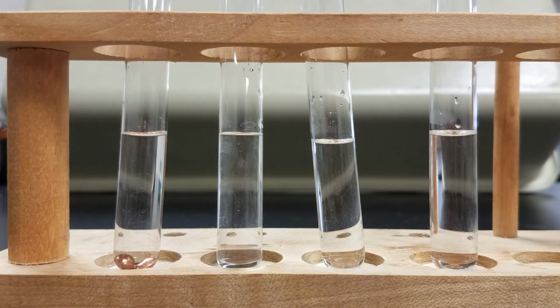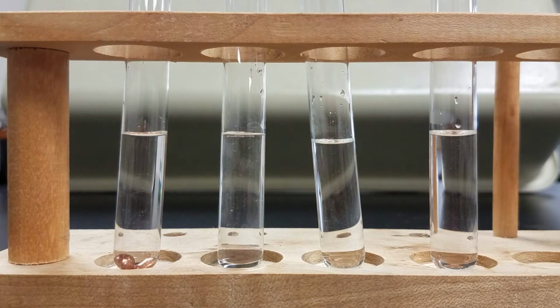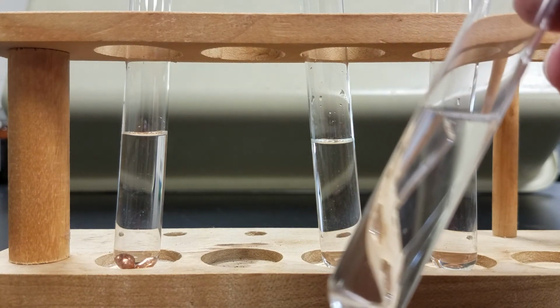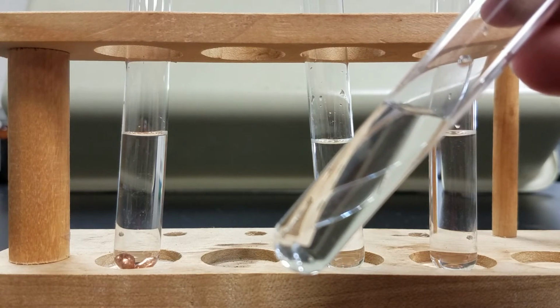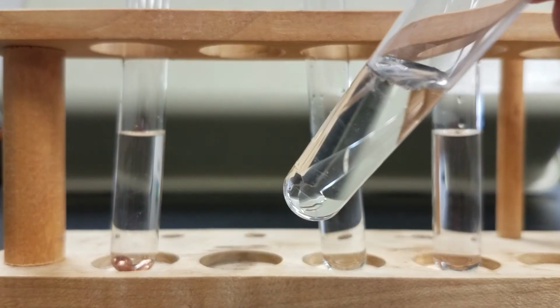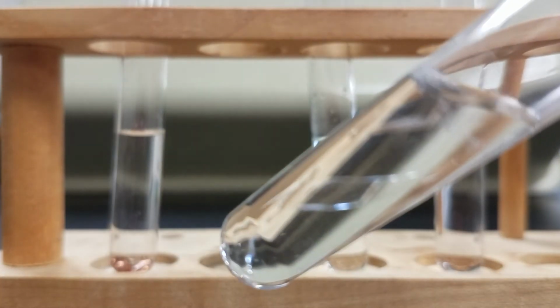So now I have my little piece of magnesium. I'm going to drop that in, and it's kind of sitting there on top of the solution. Looks like maybe I'm getting some bubble production. I know that's kind of hard to see. My camera is not really focusing there, but if you can look very closely, maybe if I turn it this way, you can see that we're starting to get some bubbling.